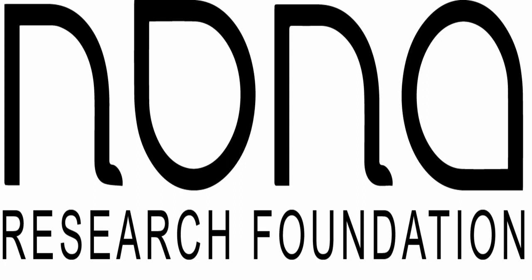Well, just to start it off, we didn't have any applications in parallel, but one of the things that we did have to do as we were creating a high-throughput automated lab was to integrate with our PCR machines and some other benchtop robots, and make sure that the chain of custody would be maintained through all of this.